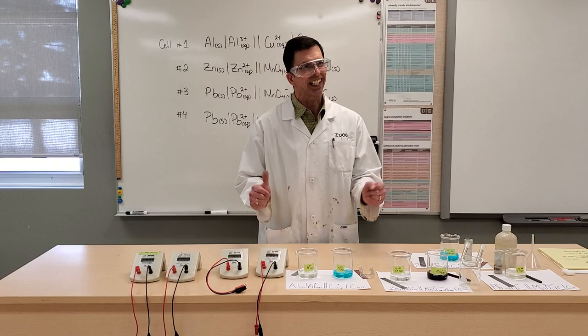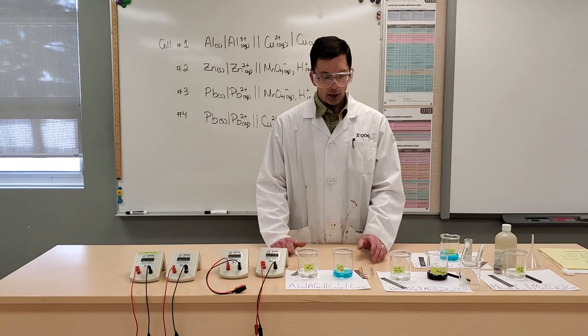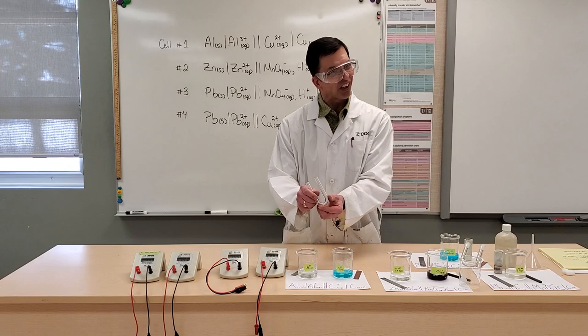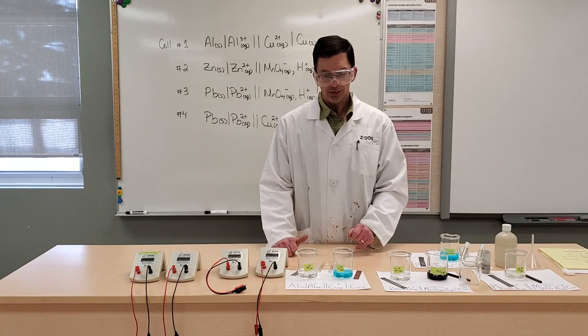And so our purpose today is to run through two different sets of voltaic cells having different constructions, one with what we call a U-tube, a salt bridge. When I was in grade 11, this is all we knew is U-tube. And we also have the porous cup construction.